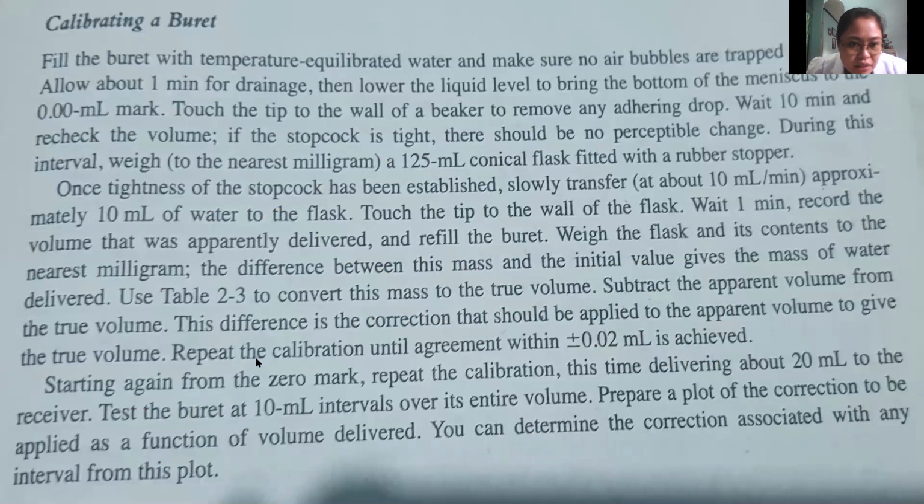Okay, you repeat the calibration until agreement within plus and minus 0.02 ml is achieved. Okay? The difference we got is 0.1755 ml. You repeat until the differences between trials are within plus or minus 0.02 ml.